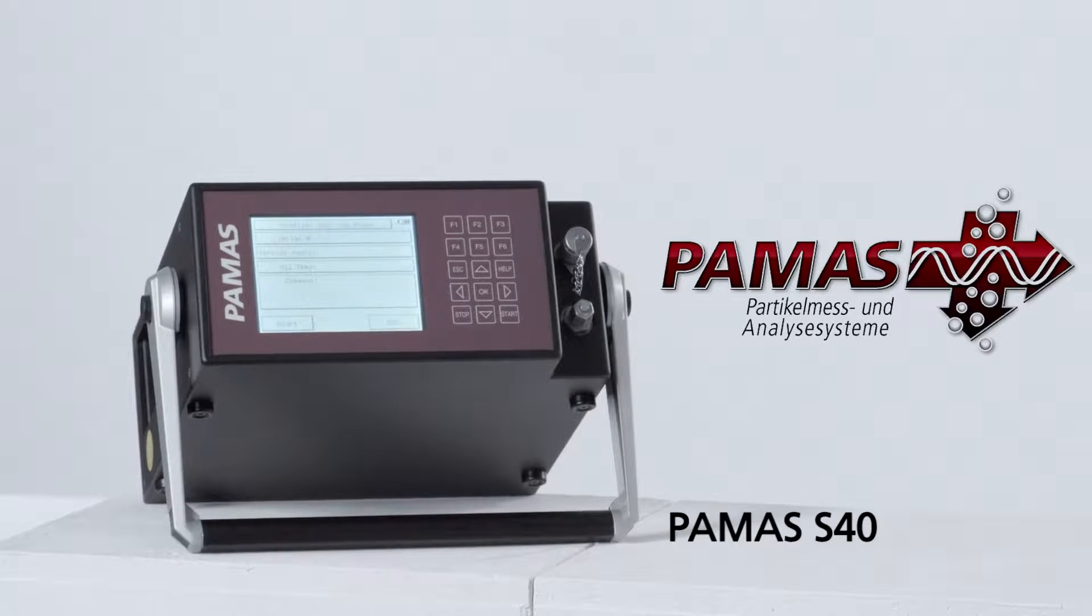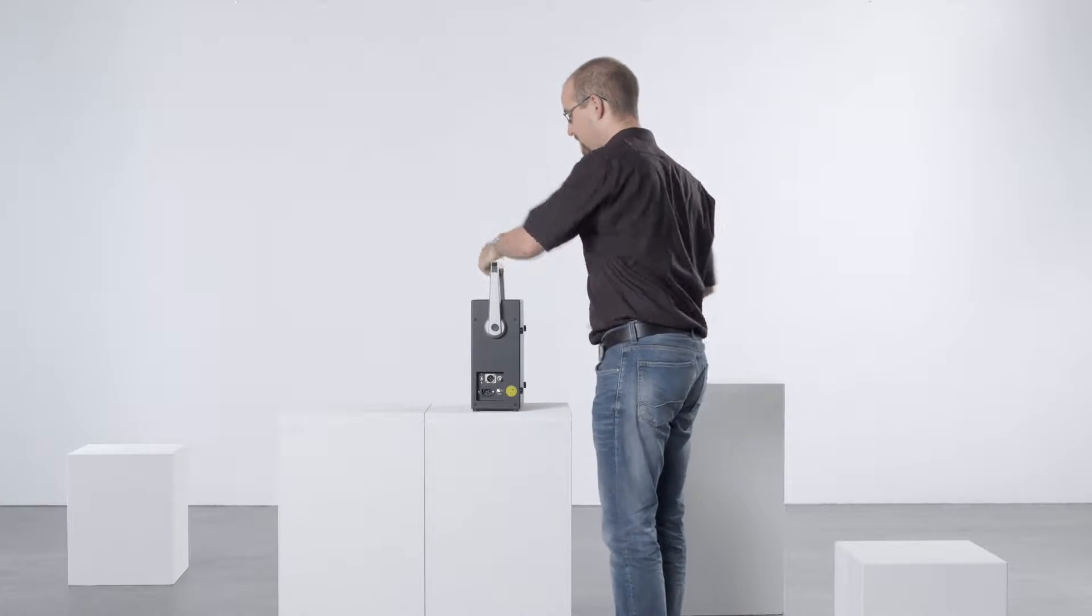The PAMAS S40 Particle Counter. A portable particle counter available for various applications and fluids.